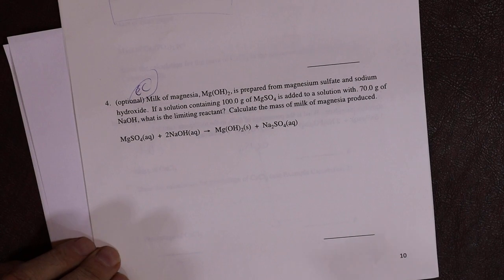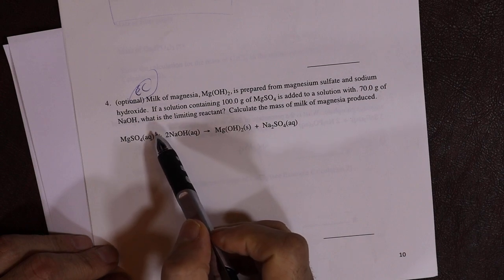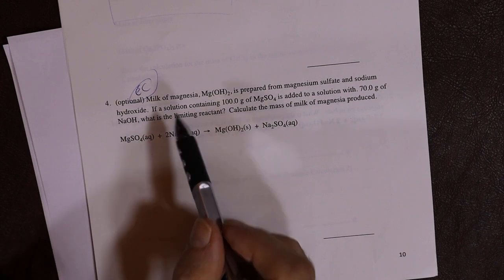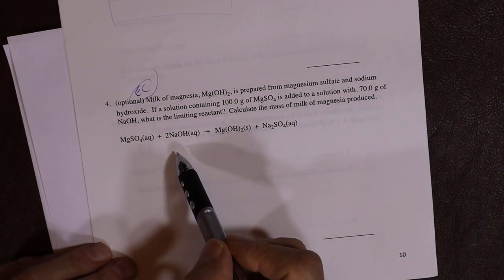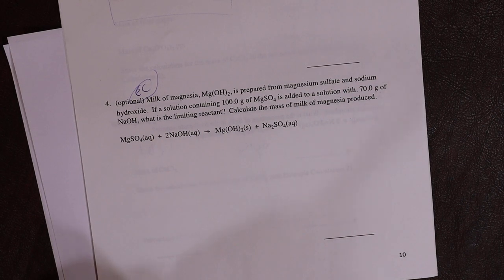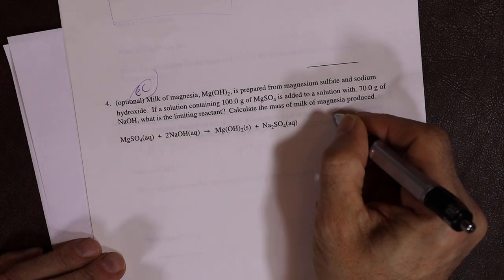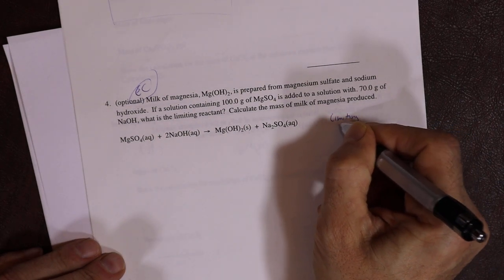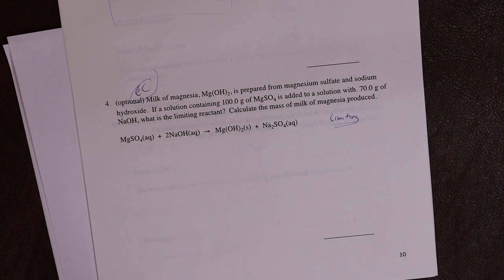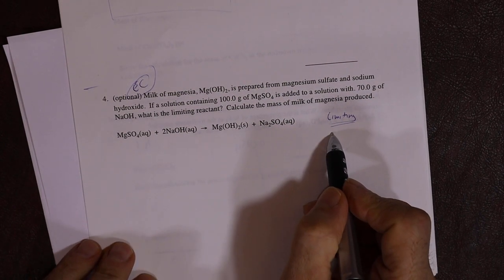Milk of magnesia, magnesium hydroxide. You take that when you've got an upset stomach. Why? Because if you've got an upset stomach, you've got too much acid in your stomach, and hydroxide will calm your stomach down. It will get rid of that extra acid. When we make this stuff, this is going to be a limiting reactant problem. If you read and finished the packet, chemical composition, you'll know how to do this. So maybe you want to delay this one until you finish the packet.